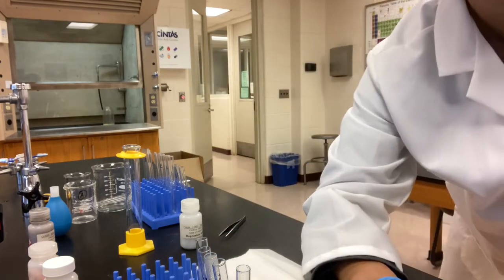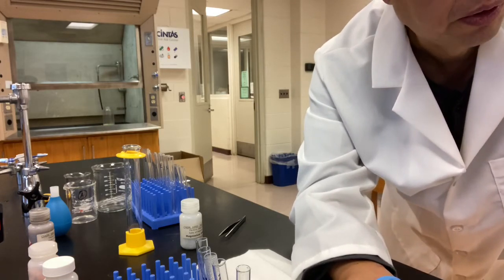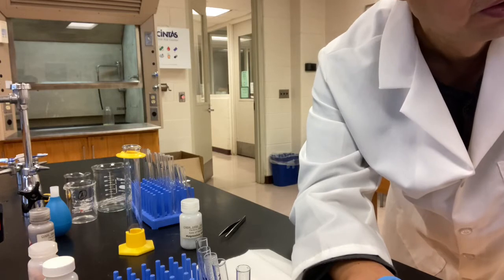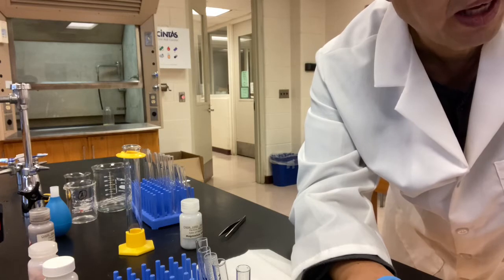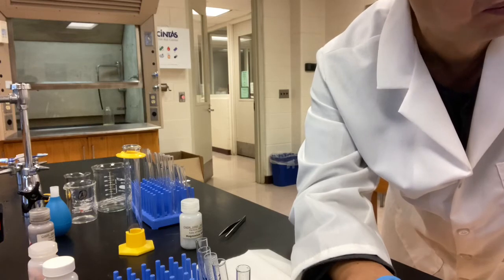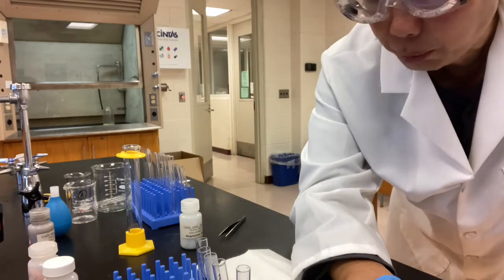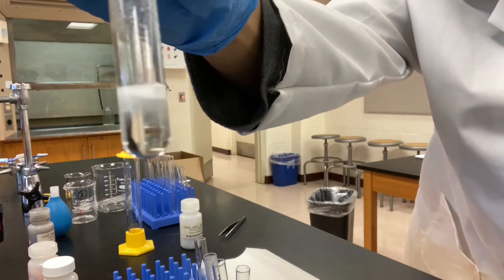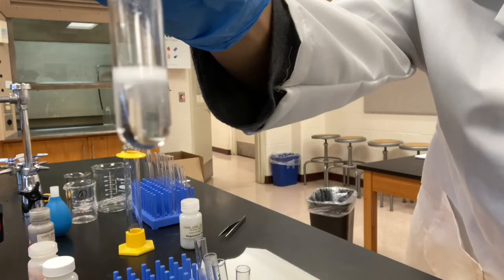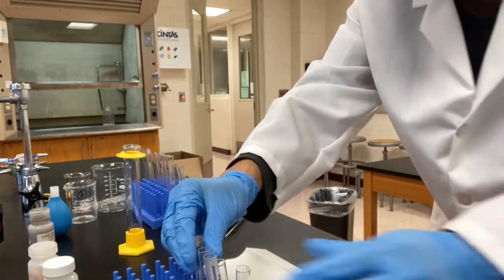So here is the reaction rate sequence. 3M sulfuric acid, the fastest. 6M HCl, the second. 6M nitric acid, the third. 6M acetic acid, number 4. And 2M phosphoric acid, number 5. All other 4 are done. This is phosphoric acid. It is still reacting. There's still magnesium in it. In all the other 4, the magnesium pieces are gone. They're all done.